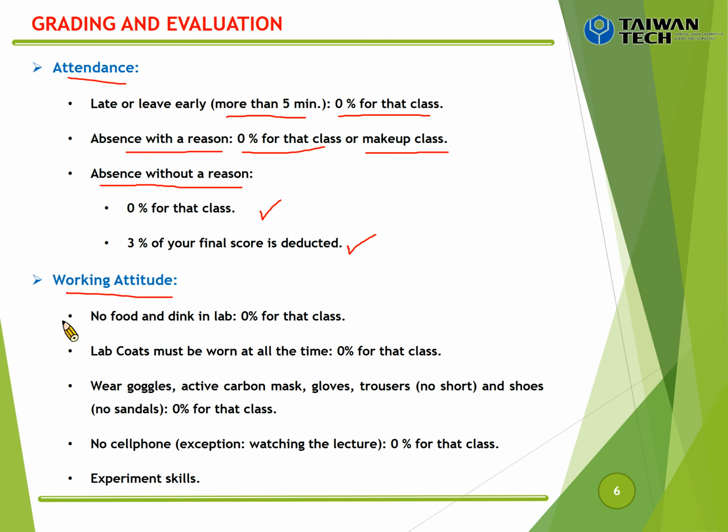so you cannot eat, you cannot drink in the lab. So no food and drink in the lab. If you do it, you will get 0%. Okay, if you feel hungry, you can ask me, you can go out to eat or drink, okay, outside, not in the lab. Okay, and you need to wear the lab coat. If you don't wear the lab coat, you also get 0% for the working attitude.